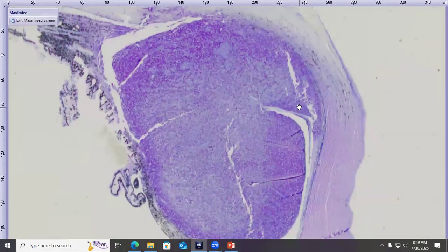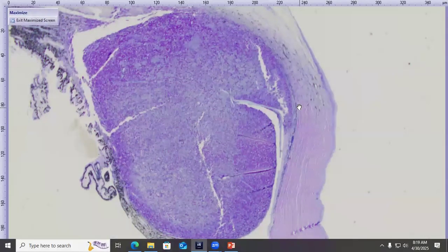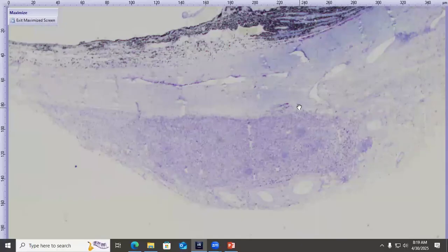So in this case, we asked for follow-up saying, does this dog have a history of mastocytosis or mast cell tumor elsewhere in the body? We strongly suspect that this is probably a metastatic lesion, just given that we have 2 of them here in kind of atypical locations. The clinician did respond and say that, as far as they know, this dog does not have mast cell tumors elsewhere in the body. However, they do have several cutaneous and subcutaneous masses that haven't been worked up. So it's in the realm of possibility. I think they aspirated a couple of them and didn't yield mast cells, but who knows? There could be one hiding elsewhere. At this stage, we just don't have sufficient information to say if this could be a primary tumor or not.